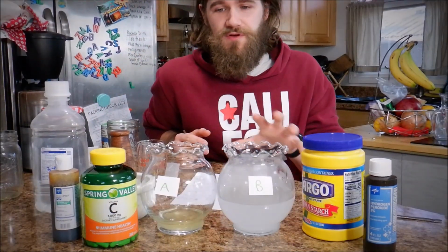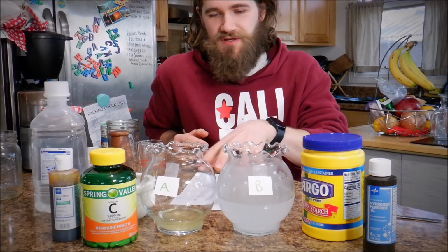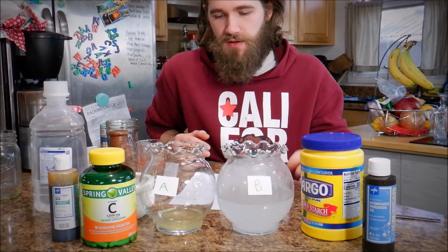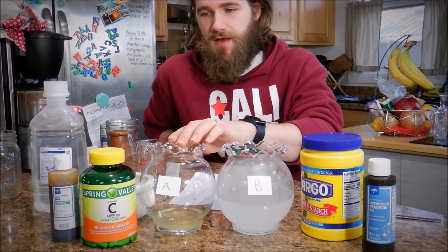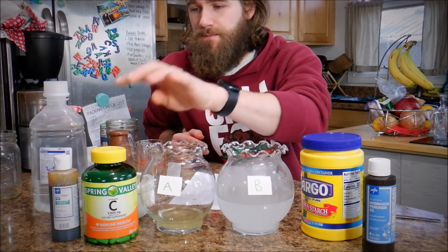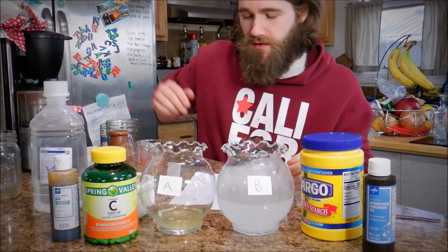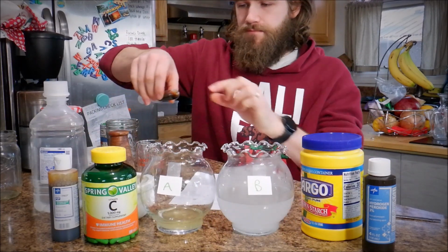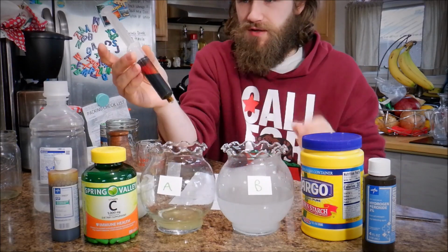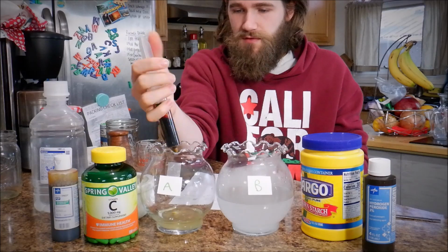Okay, now that we have filtered down a little bit, I switched containers to have bigger containers. So we still have solution A and solution B. So solution A right now is just the dissolved vitamin C. So now we're going to be adding a little bit of povidone iodine. I have the 10% solution, so I'll be using a little bit less, approximately 12 mLs.